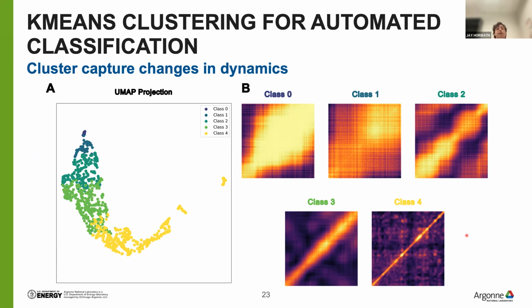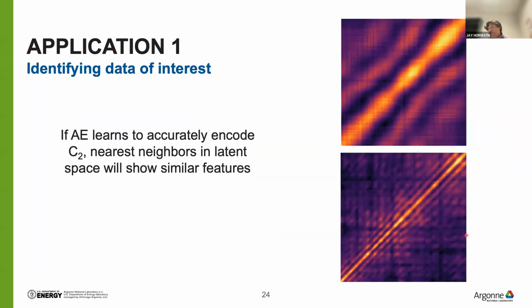And so all of this is just to say it's a proof of concept, and that we are able to actually teach the neural network physics so that then hopefully we can use it to understand the complex data. One way that we might want to do this is to take anomalous data that we might not understand and see if there are any similar examples. So that's what I'm going to be showing here. I selected these two sample two-times because they show similar patterns. They show these fringes. For reference, we do understand where these fringes come from, but it's still a feature in the data that we would want to recognize, to see how frequently it happens. How does the change in the frequency of the fringes occur?